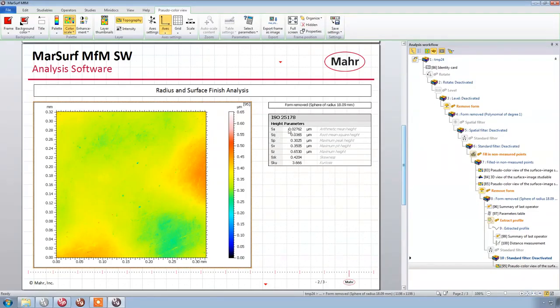And if we look at the roughness, I was really expecting single-digit roughness here, and we are seeing 27 nanometers. Still very low roughness. I was expecting 10, 7, 8 nanometer roughness. What that says to me is that we are still picking up some of the waviness component on this surface. We're not really seeing the surface finish.